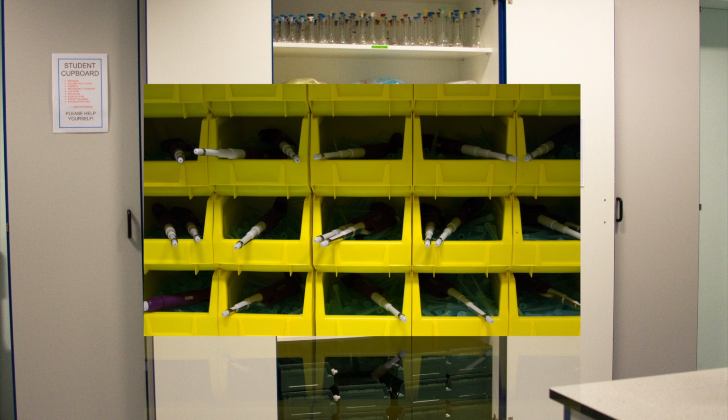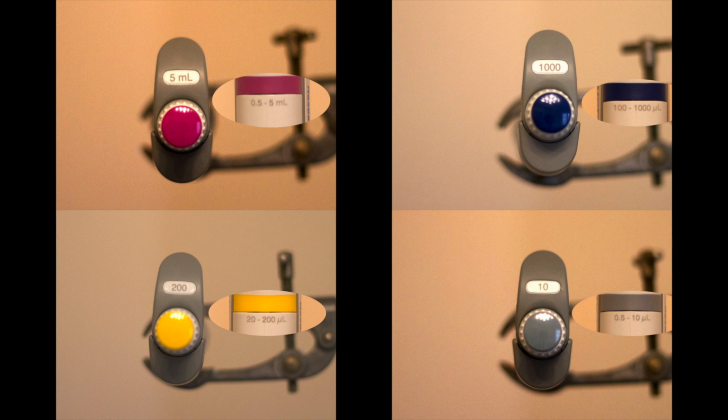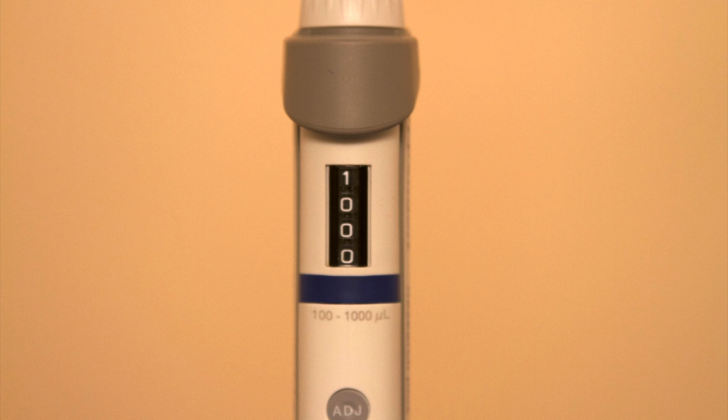When working with pipettes, it is important to select the correct pipette for the volumes that you want to measure. There are 4 pipettes that you will be working with, each accurate across a defined volume range. The numbers on the side of the pipette give you the volume range over which it can be used. You must never set the pipette to dispense a volume outside of this. The window on the side of the pipette displays 4 digits that are adjusted to set the pipette to the desired volume.